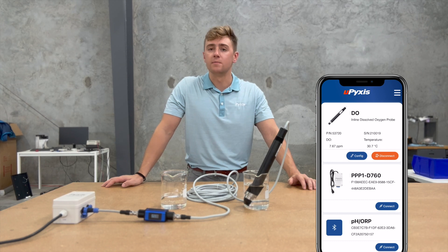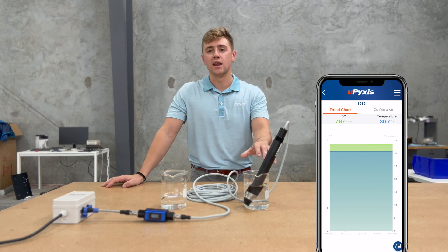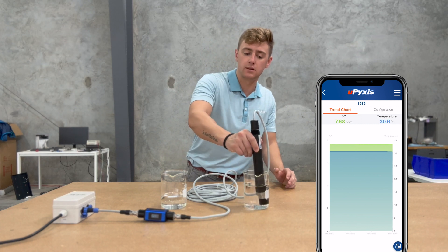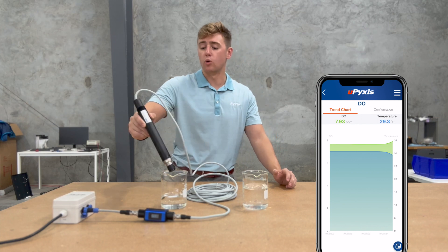You can see that I have it in tap water right now, and when it's in tap water it's going to be reading right around where we suspect it to be, which is 8 ppm. I've also taken the liberty to prepare a small beaker of water that has tap water as well but with sulfite added.